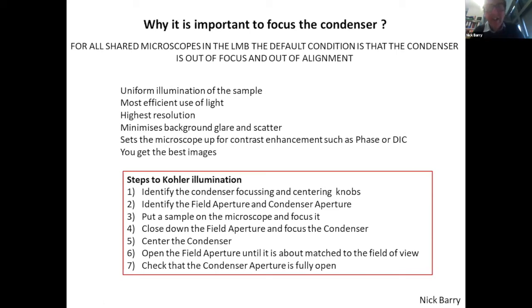Now, obviously that is a very condensed set of steps for lots of different microscopes. They're all different, but essentially you can identify these stages on every microscope, and they might not necessarily allow you to adjust them, but you can identify them. And optimizing those will optimize certainly the white light performance of the microscope, when you're using a lamp, sample, objective, eyepiece type arrangement.